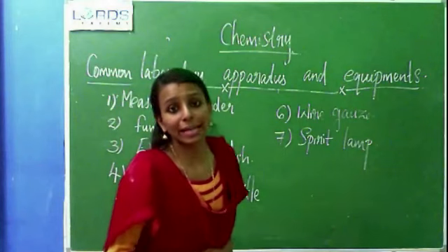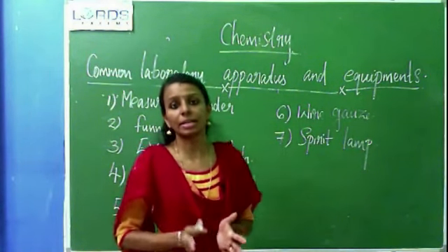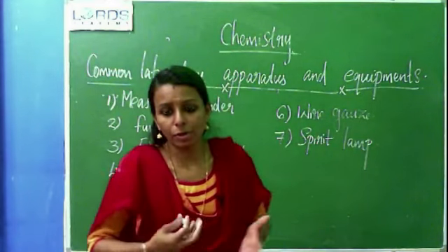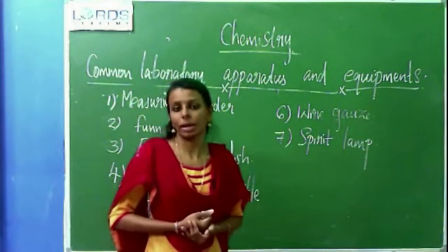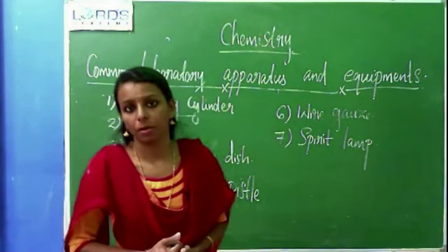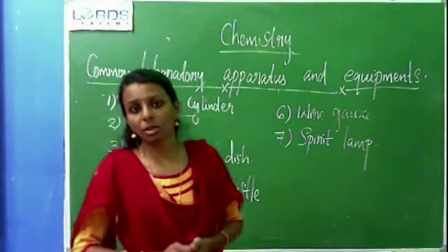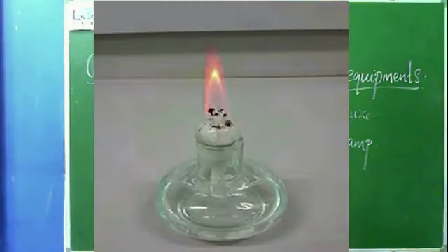The next one, spirit lamp. Yes, you all are familiar with this one. What is the use of the lamp? To get heat. The spirit lamp is used to heat up the substance. Just look at the picture. This is a spirit lamp.